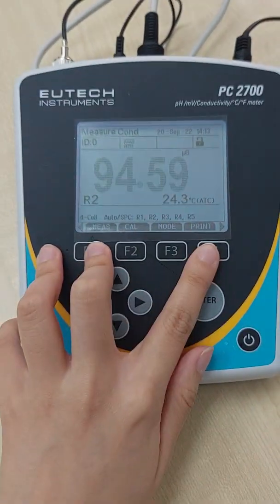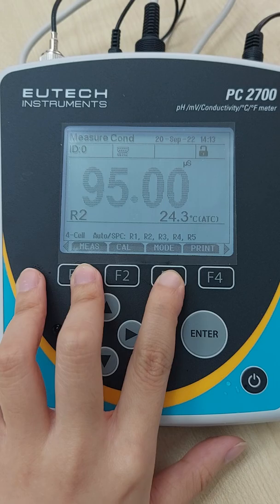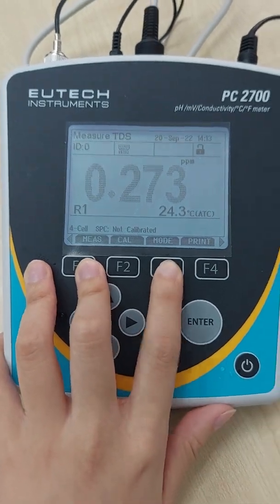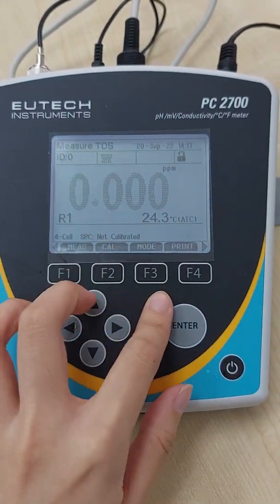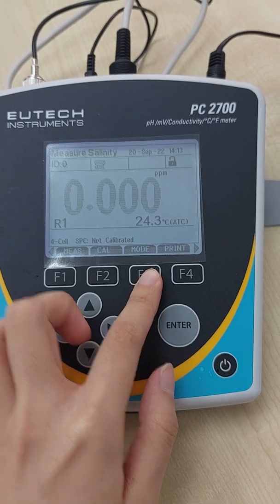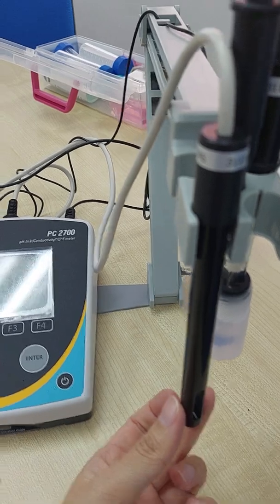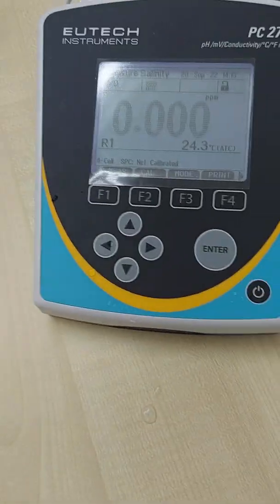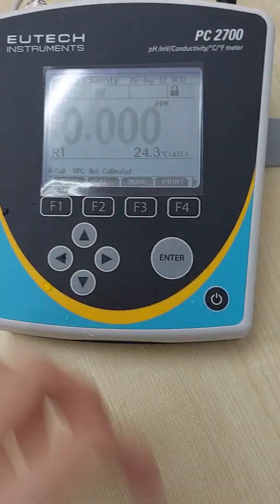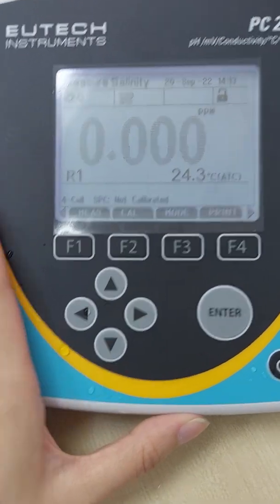Conductivity. Just now we did the calibration ready. So conductivity, TDS, and also salinity, they use the same probe, this black color one. Just that you need to get a separate calibration solution for salinity and also TDS as well.